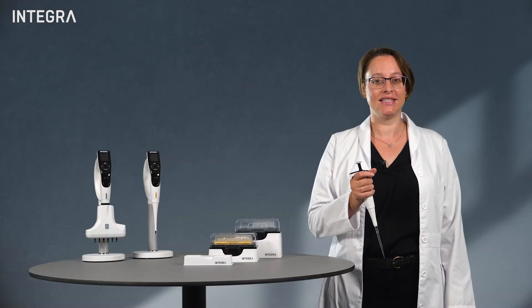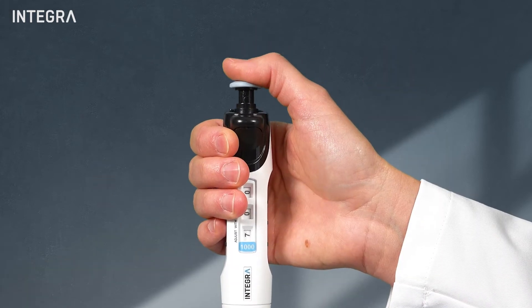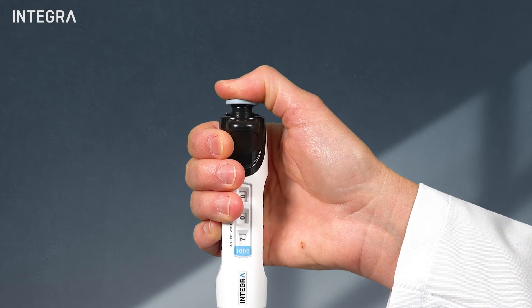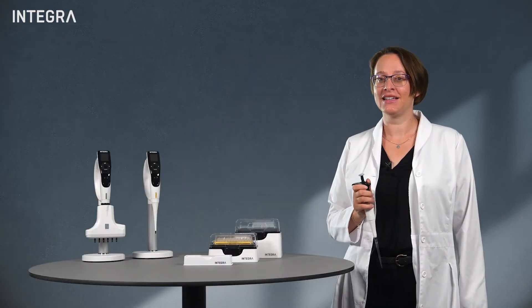Also, consistency in how fast you press the plunger can really have a big impact on your precision values. Next, we talk about electronic pipets.